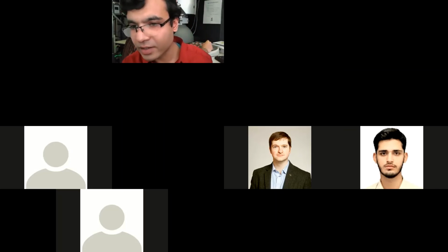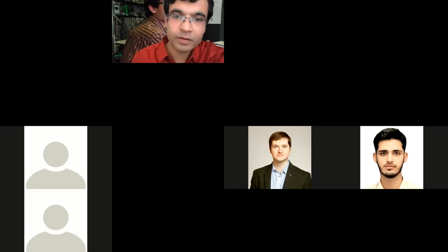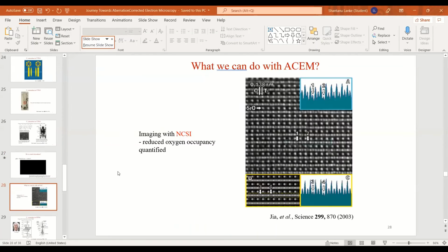So I can see one question here: what is the difference between image corrector and probe corrector? Okay, so in the image corrector, let me go back to the slides.